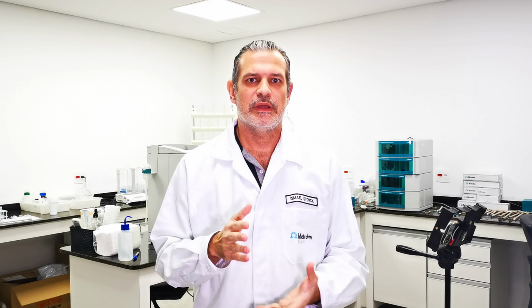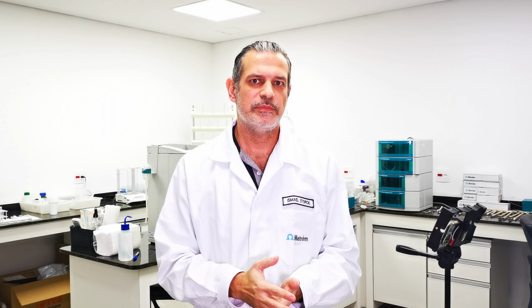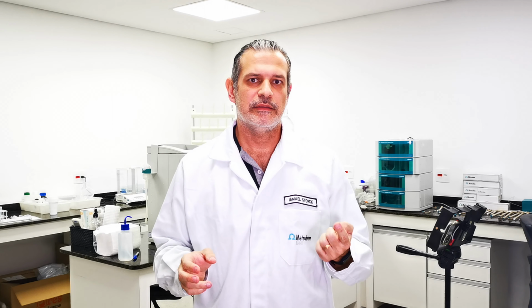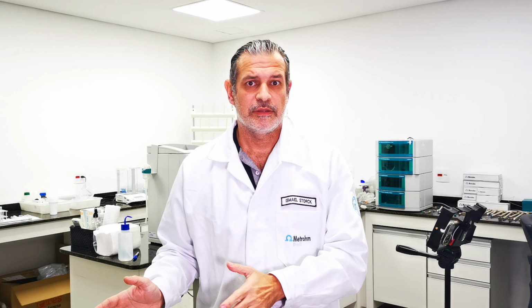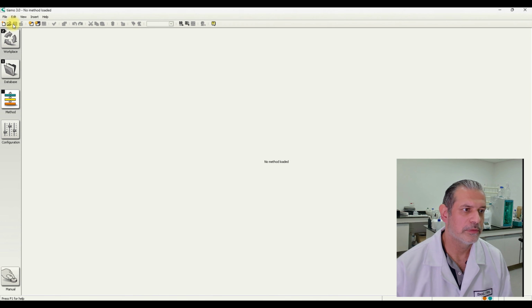Hi, how are you? In our last video, I taught you how to create two methods, one for pH calibration and another one for pH measurement. But today I'm going to show you how to create just one method to perform both the pH calibration and the pH measurement. So let's get started.